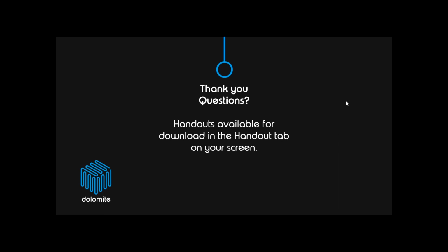Where can we get or purchase lipid libraries? The most comprehensive lipid library. There are companies available who have these available. I think you just need to do a little bit of research into that to find out. Or you can develop your own as well, and that's the point of a system like this, to enable you to have that flexibility to create your own library and test out what's best for you.